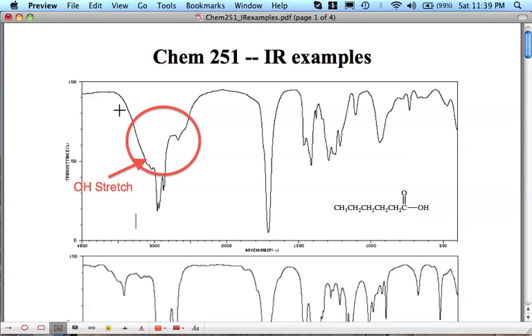This actually also occurs in the NMR spectra, and it's due to the wide variety of OHs that you have depending on the type of hydrogen bonding that's going on. So some molecules are more hydrogen bonded than others in the mixture of all the molecules in there, and so you get this broad dispersion of various types of stretching. So that's our OH. I will point out that in a carboxylic acid, this OH is often so broad that sometimes it's hard to even know whether it's really a peak or whether it's just a cruddy looking IR. So that can sometimes be a challenge.